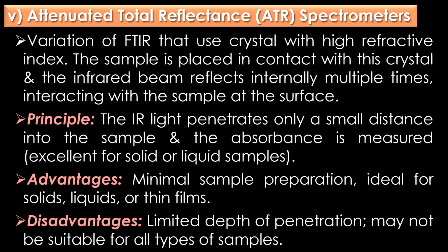This method is excellent for solid or liquid samples. Advantages: minimal sample preparation, ideal for solids, liquids or thin films. Disadvantages: limited depth of penetration, may not be suitable for all types of samples.